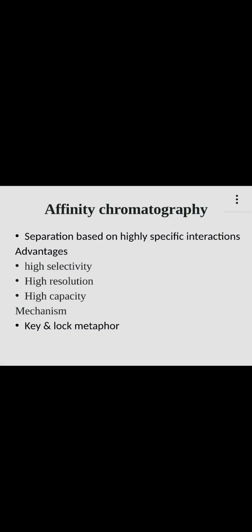So affinity chromatography is a technique that relies on specific interactions between the analyte and the stationary phase.